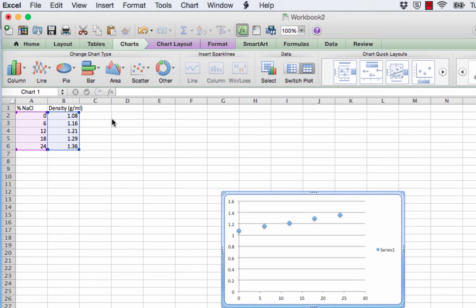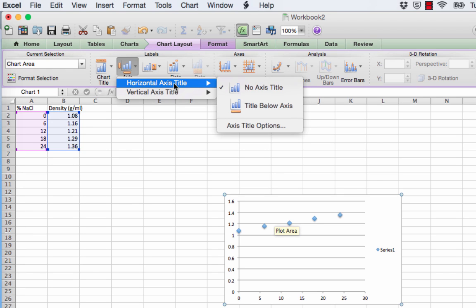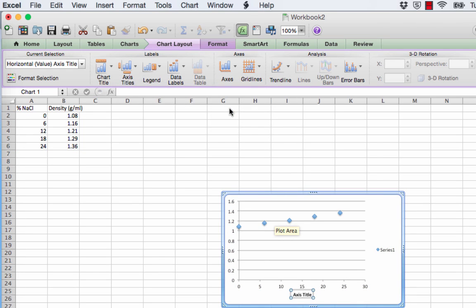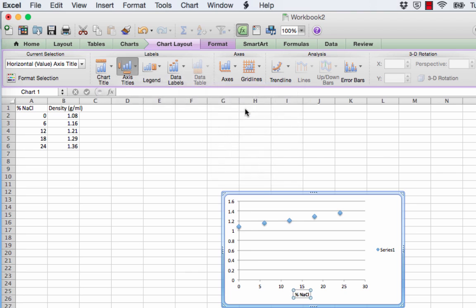The graph appears in its most simplest form, but we want to have a fully labeled nice graph. And so by choosing Chart Layout, we can add a title and axis titles to our graph. So I'm going to first add my horizontal axis title and that's going to be my percent sodium chloride and there we have a title. I'll then add a vertical axis title and that will be density in grams per milliliter.